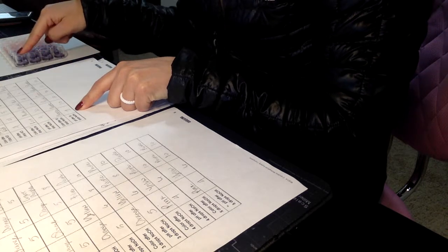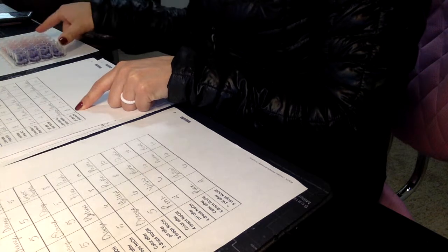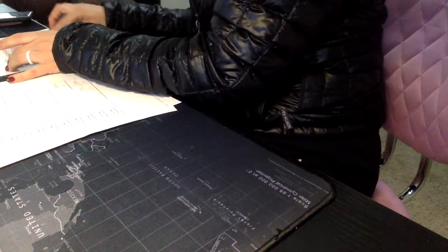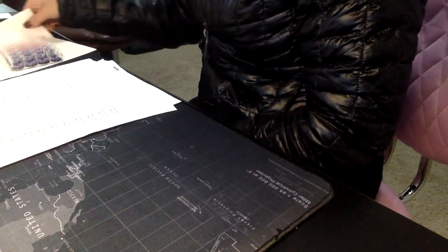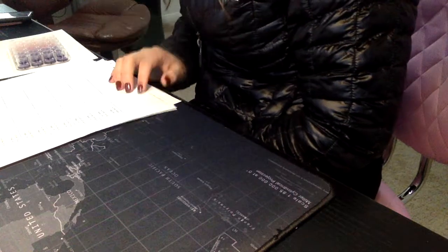So I basically went along a row as I was testing these, and for the second table, I left this as a sample, and then I worked my way out to see the color change, and I did record it with a photo.